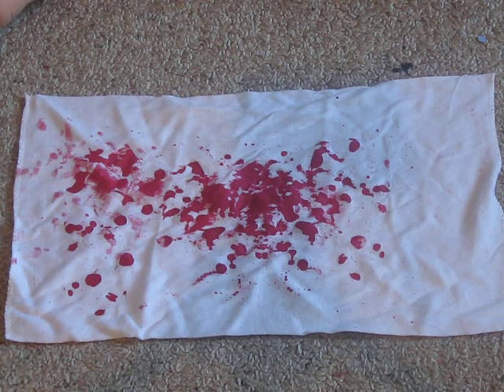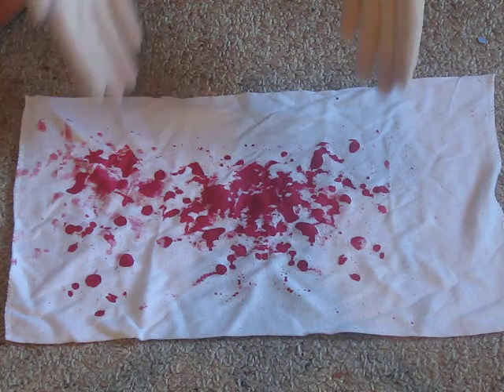Hello YouTube viewers. Today I'm going to show you how to properly collect a piece of evidence found at a crime scene. In this instance, a bloody towel.